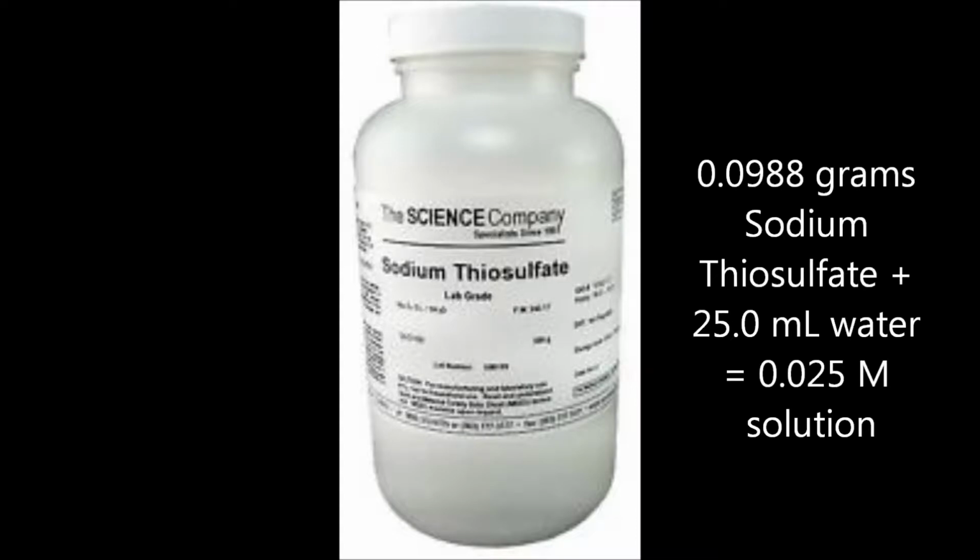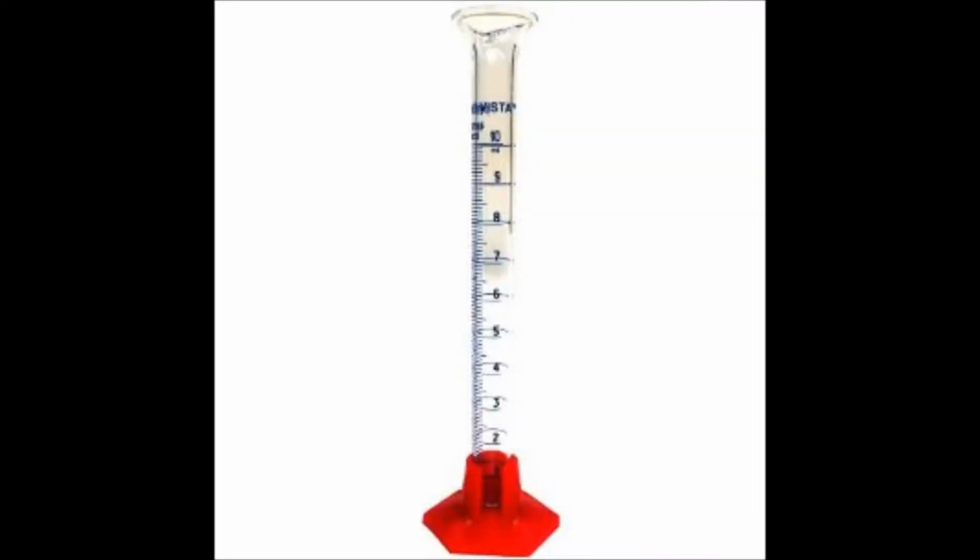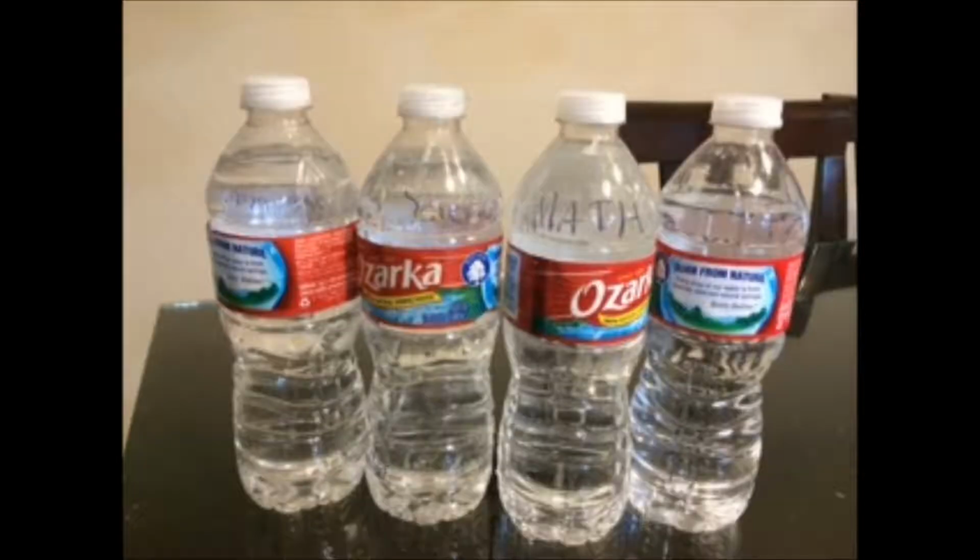With a pipette full of the solution, we counted the number of drops it took for the solution to reach 1 milliliter in a separate 10 milliliter capacity graduated cylinder. We repeated this 3 times so that we could measure the average volume of solution in 1 drop. After the solutions were made, the experiment could begin.